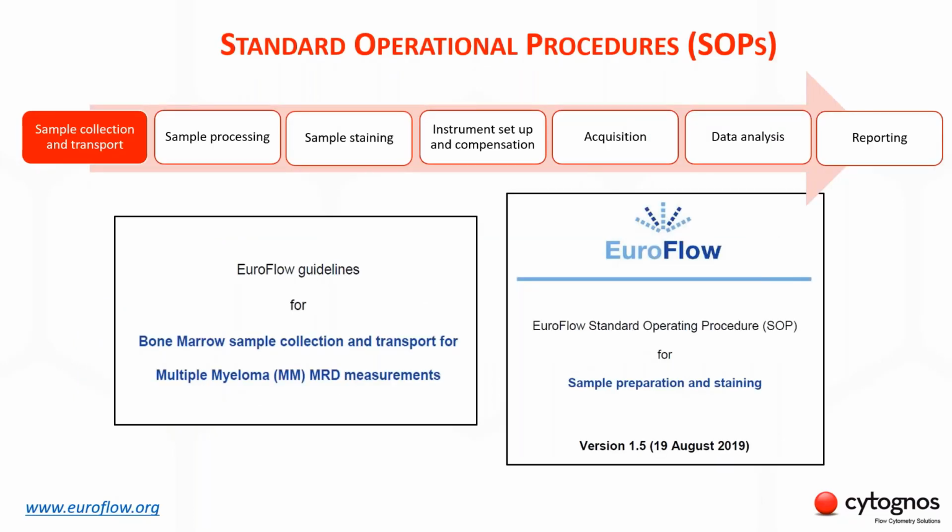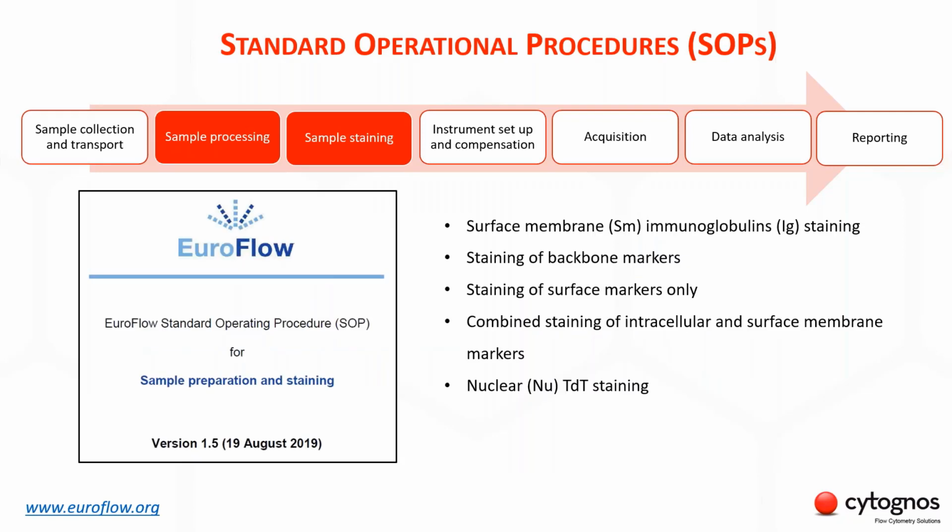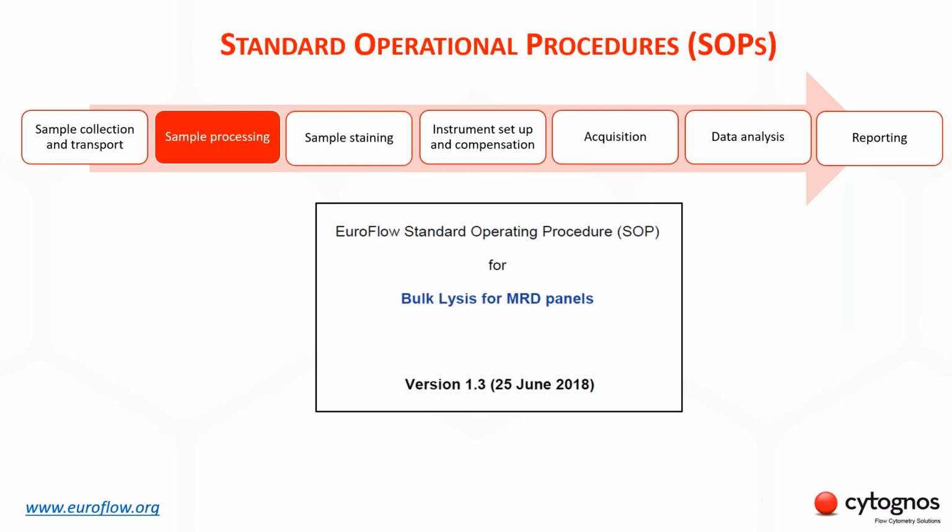There is a protocol for bone marrow sample collection and transport, specifically for myeloma MRD, but also there are guidelines on sample collection for regular testing. EuroFlow also provides a protocol for sample processing and staining, including a detailed explanation about extracellular and cytoplasmic antibody staining, and other more specific ones, for example, regarding the TdT marker. There is also a specific bulk lysis protocol for MRD testing.